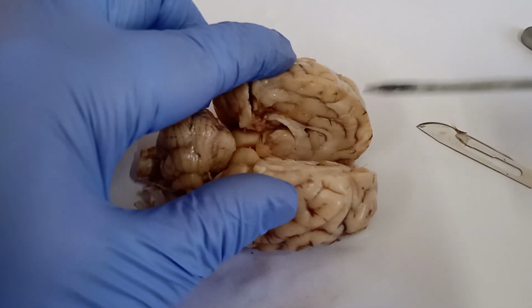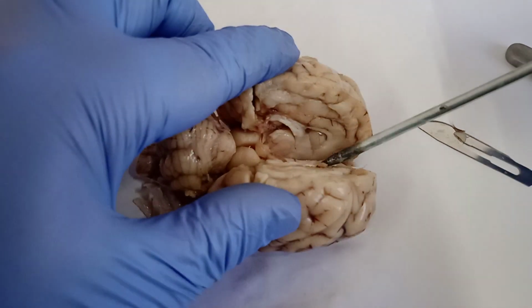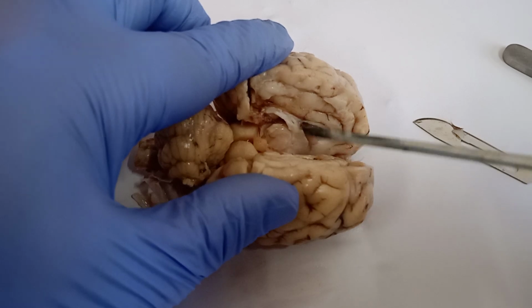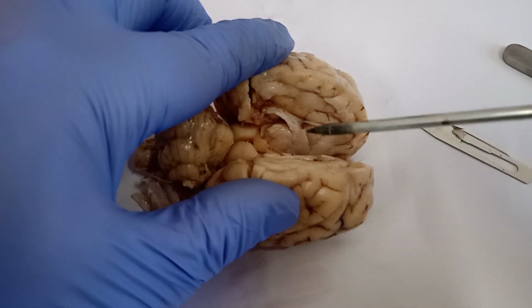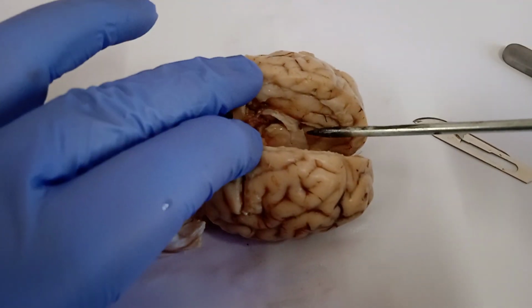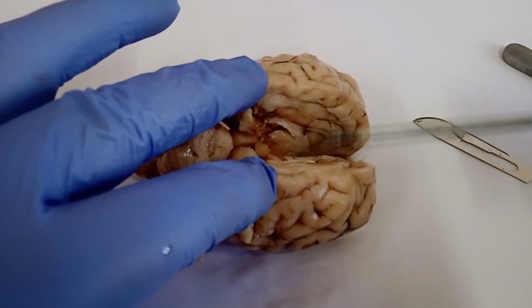It's the pineal gland. And on the sides you can see the cavities. This side also there is a cavity. So basically these are the ventricles. There are four ventricles in the brain. Two lateral: one of the ventricles will be here, this one, and one will be here. So these are the two lateral ventricles.